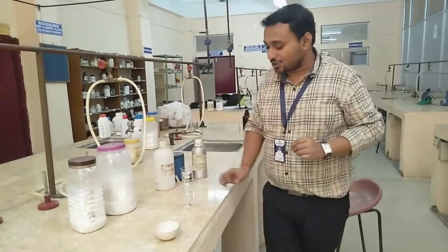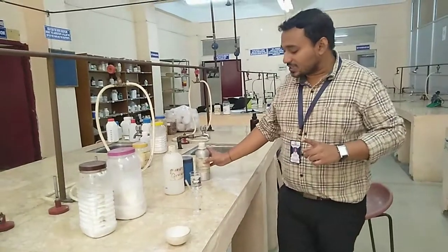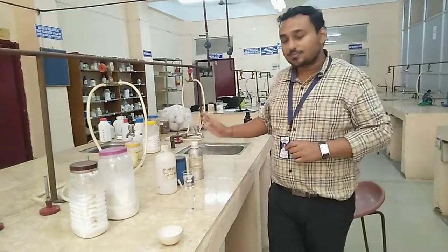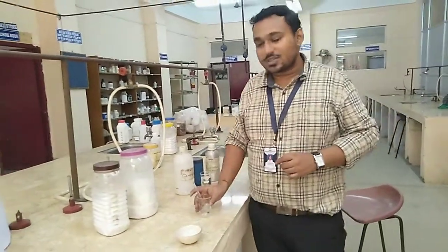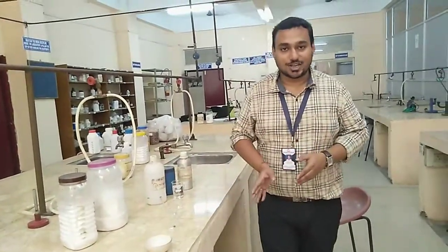This is the procedure, and at last we are adding the perfume, that is peppermint oil. So this is the simple procedure for preparing the vanishing cream. Thank you.